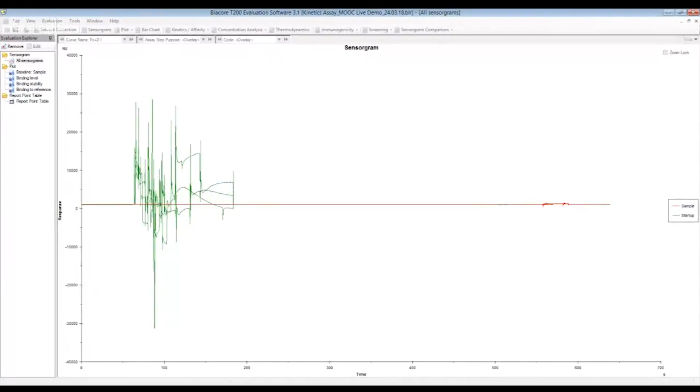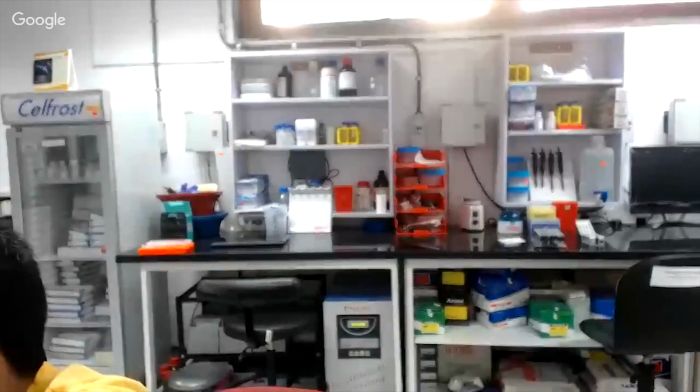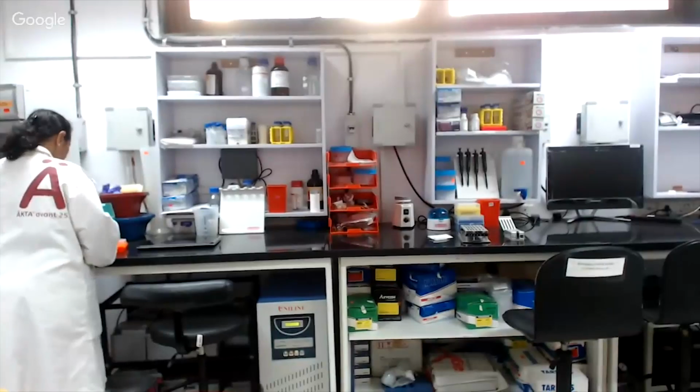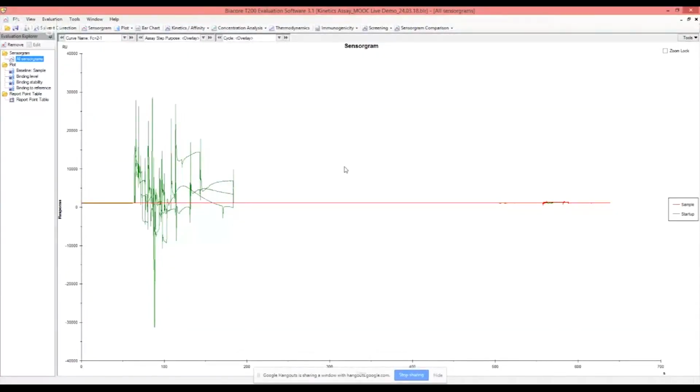From starting origination from the sensorgram. Yeah, from here.